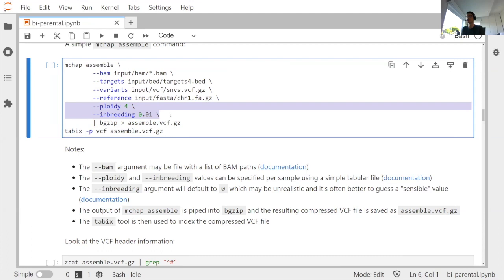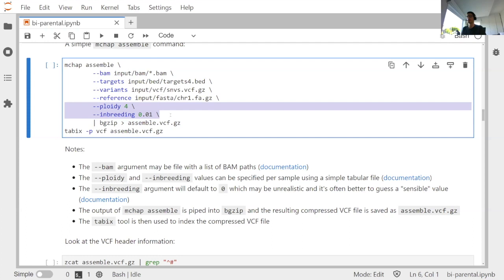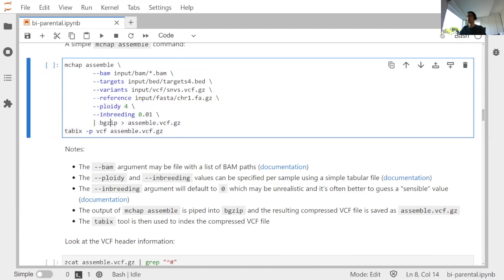The inbreeding coefficient tells you about the expected homozygosity of a sample. The higher it is, the more homozygous the sample is likely to be, and it plays a greater role when you have low read depths. If the output seems excessively heterozygous, consider whether you have a realistic inbreeding coefficient estimate — generally it's better to slightly overestimate than underestimate. The final two lines pipe MCHAP output through bgzip from htslib to compress the VCF file, and tabix to index it for rapid access later.